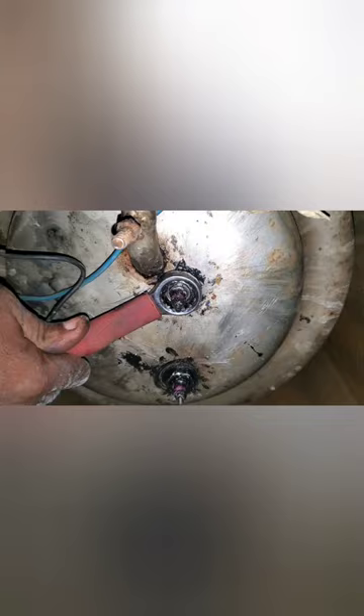The new heater has been inserted and we're tying the nuts. As you can see, the terminals of the heater have been connected. This is how it looks inside the autoclave — this is the new heater that has been inserted and connected.